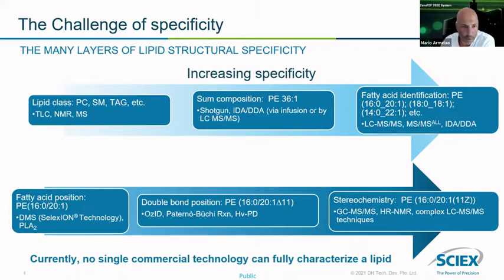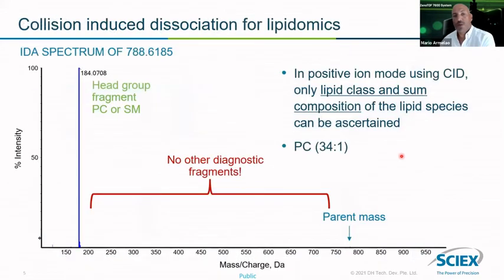And the real culprit of this is collision-induced dissociation. In many areas, everyone can complain about collision-induced dissociation. It is the ubiquitous dissociation mode in mass spectrometry. But from proteomics to small molecule to lipidomics, everyone has some complaint about a given molecule that either does not fragment or does not provide sufficient diagnostic fragments. It's very fast, but it really lets us down often.